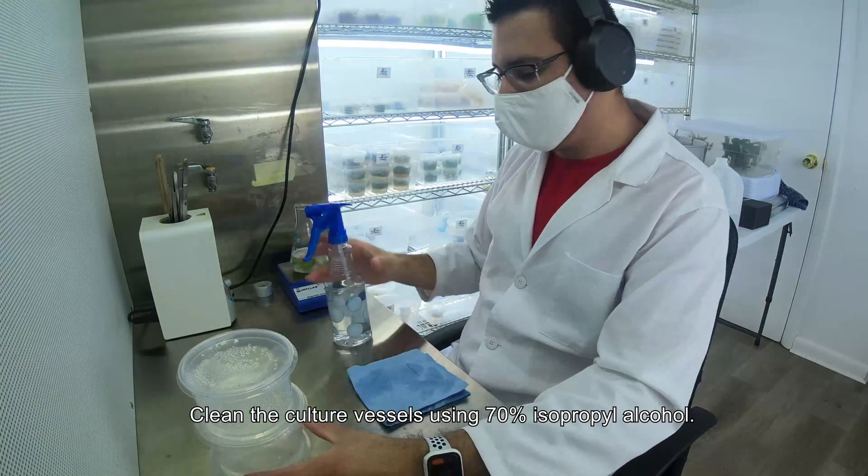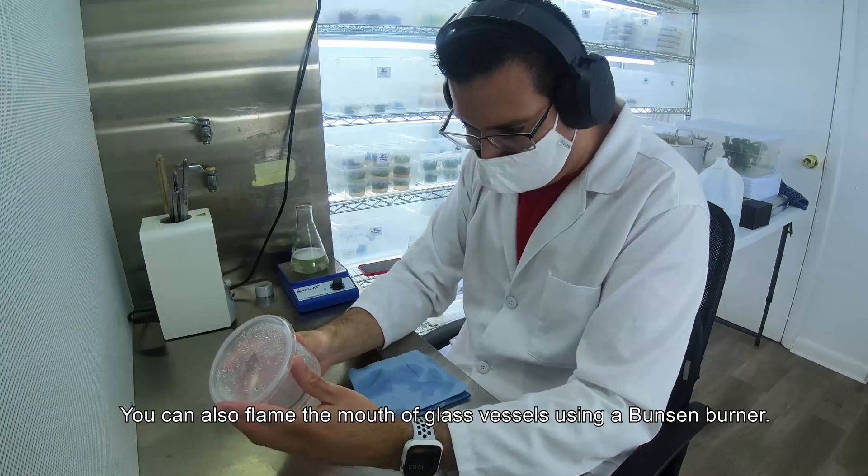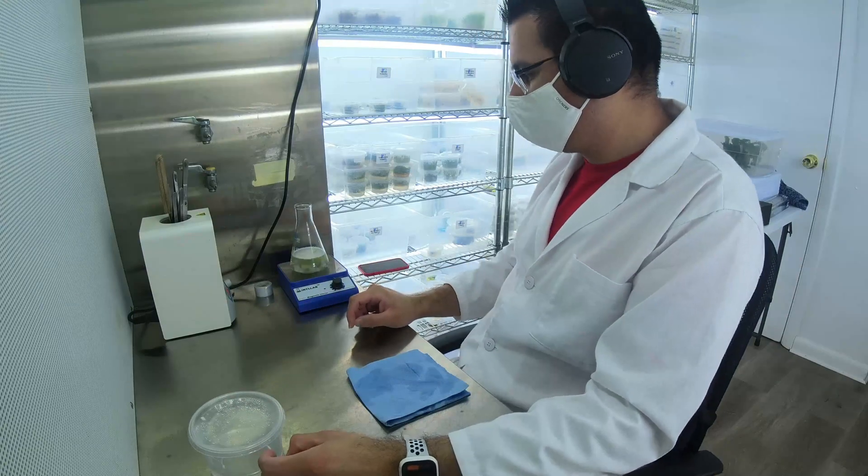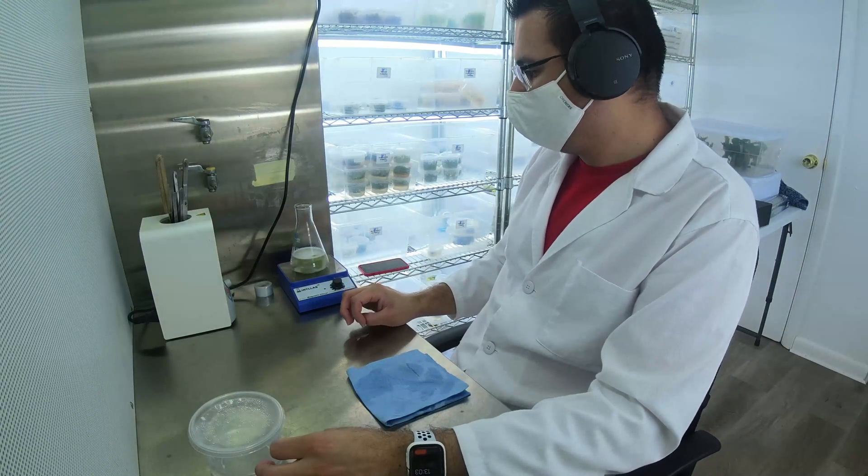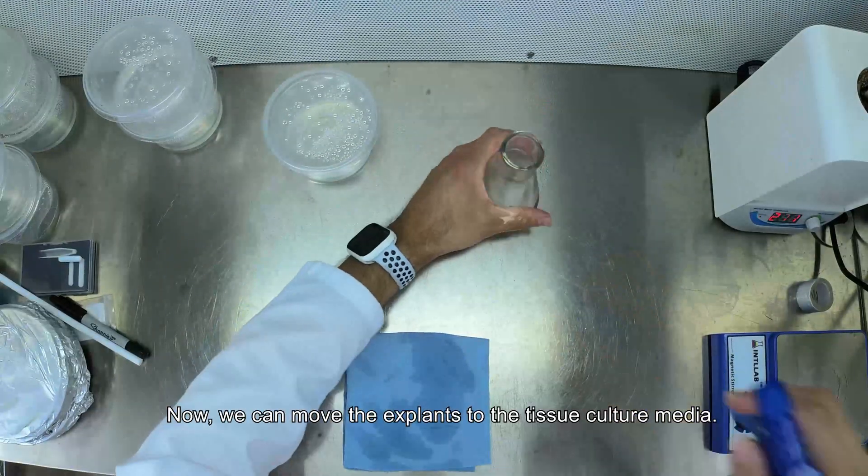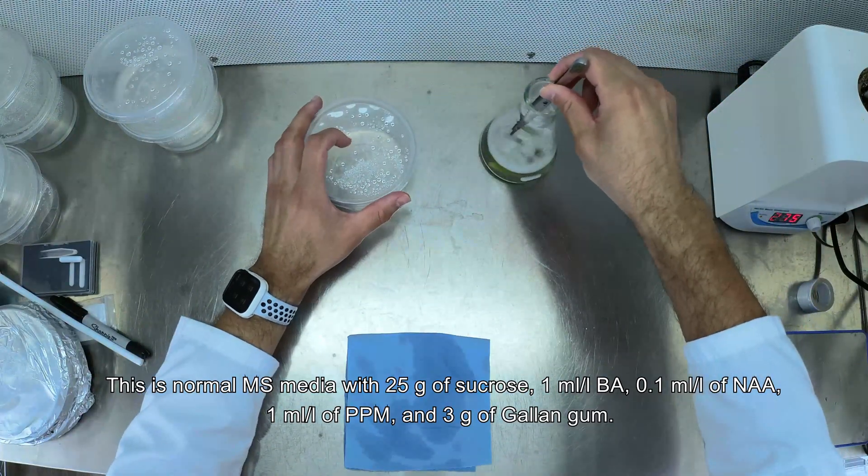Clean the culture vessels using 70% isopropyl alcohol. You can also flame the mouth of the glass vessels using a Bunsen burner. Now we can move the explant to the tissue culture media. This is normal MS media with 25 grams of sucrose.